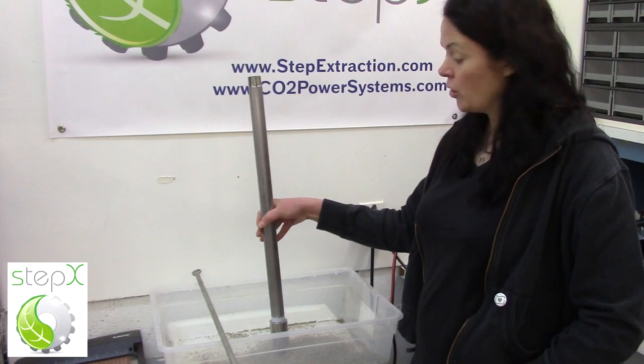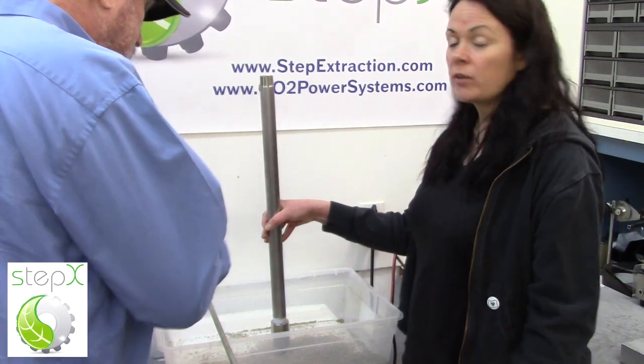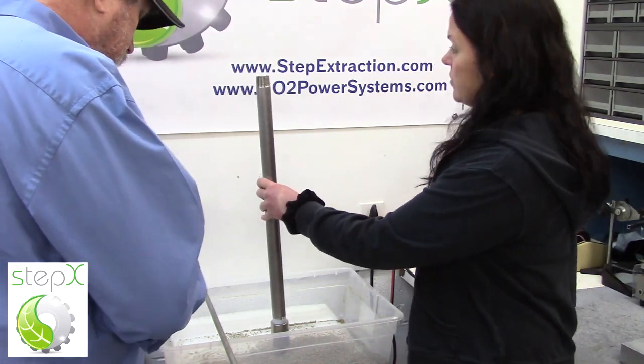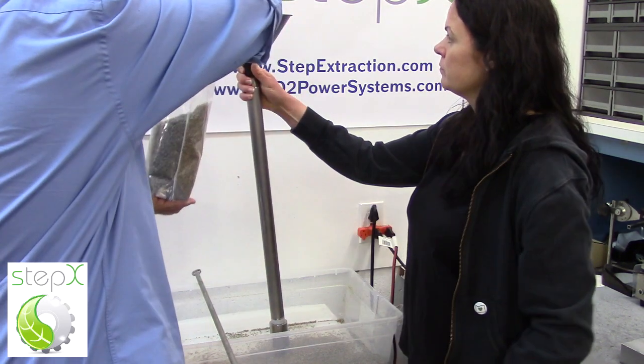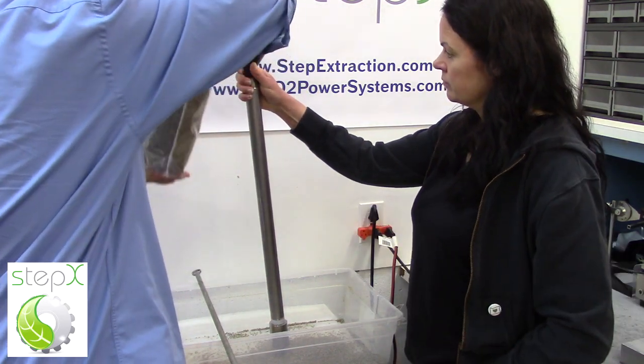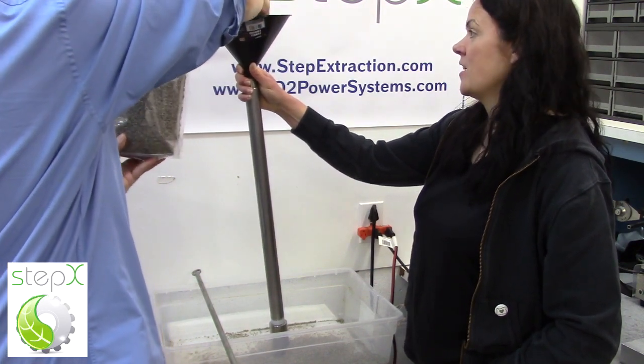Now we're going to load our reactor vessel with material. Today we are using lavender. This is our 0.3 liter reactor. We will use a funnel and our material. You can see that this material is very dry, and we suggest that as well.